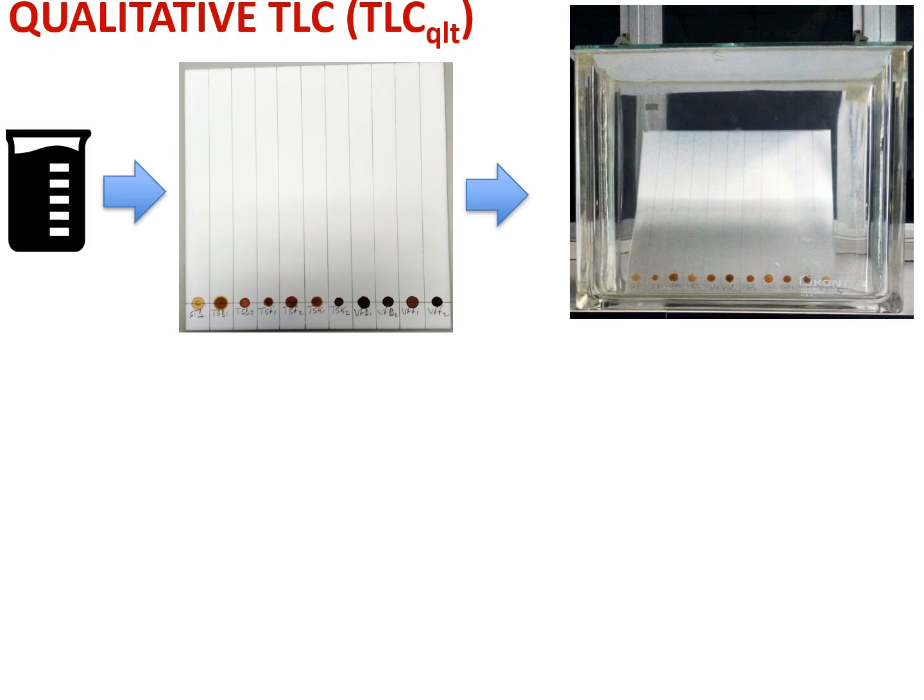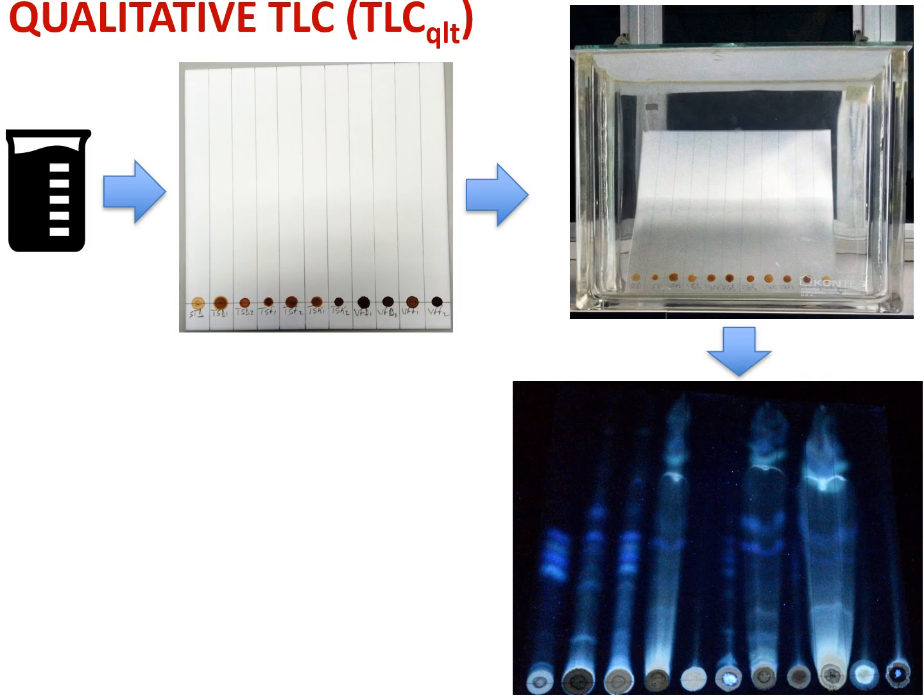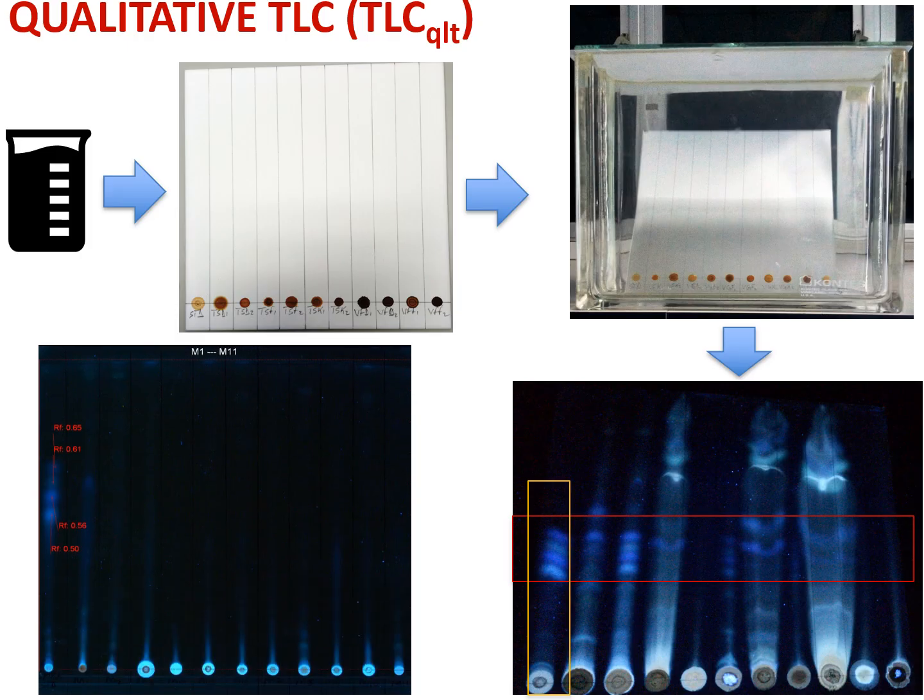And the bands produced by the standard are compared with that of the samples to confirm the presence of the analyte in the various samples. In other words, the retention factor of the standard is used to confirm the presence of the analyte in the various samples.